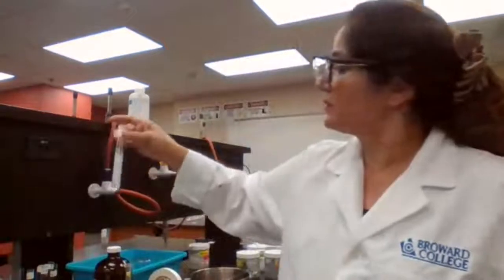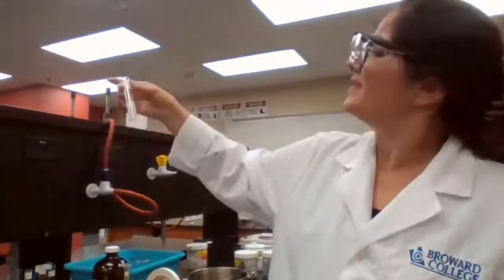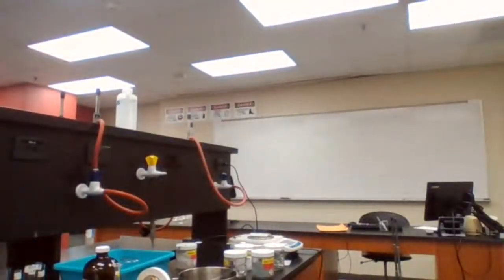So that's 0.4. Time. 5 milliliters of HCl.